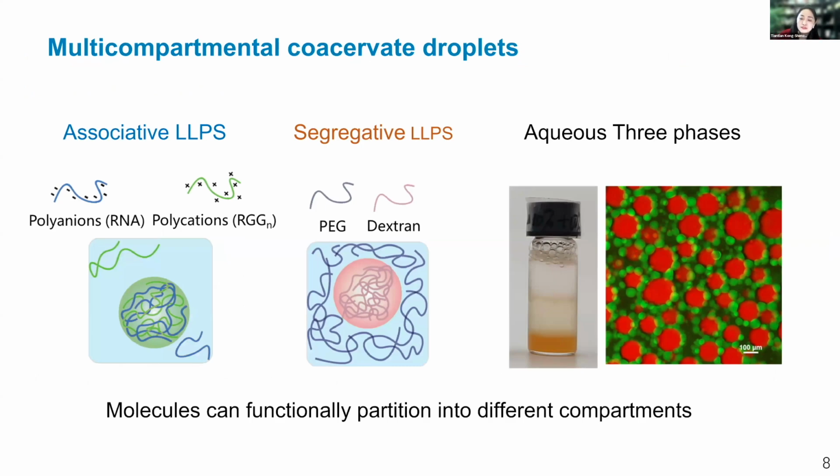So these coacervate phases can also form multi-compartmental structures if we are using multiple coexisting aqueous phases.